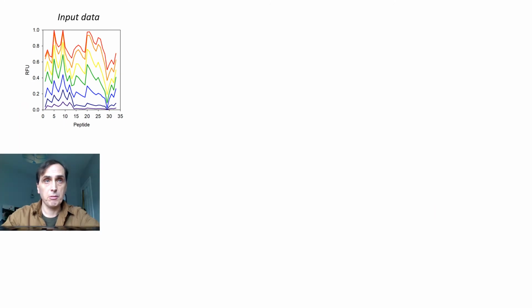So just a brief summary of the optimization process in general. Users first upload their data, and the data must be uploaded in a specific format. So it must be uploaded reporting the relative fractional uptake of each peptide over each isotope labeling time, and I'll provide more details in a later video about how to format the input data correctly.